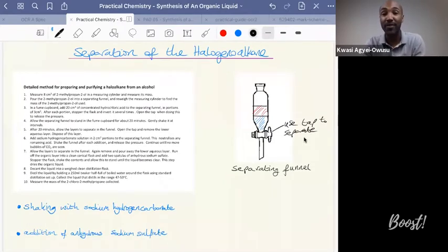In this specific reaction, we shook our organic layer with sodium hydrogen carbonate. Sodium hydrogen carbonate is aqueous, so we can imagine that that is the blue layer in our diagram. And that sodium hydrogen carbonate is, of course, there to react with any leftover hydrochloric acid. Okay, so you can imagine your NaCl. So this removes HCl.